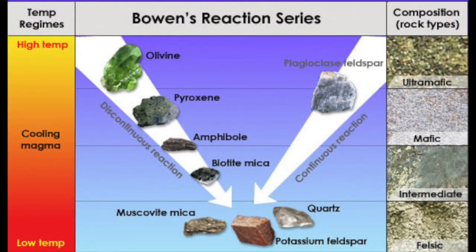And so I took this image over to the geology department and I said, okay, what is this? What's going on here? And I got a really great answer from Jim Evans, who reminded me of the Bowen's reaction series. When you've got a supersaturated solution of rock or minerals, everything is in solution when it's really hot. But as things cool down, your minerals will drop out of the solution and begin to crystallize. That's what the Bowen's reaction series is.